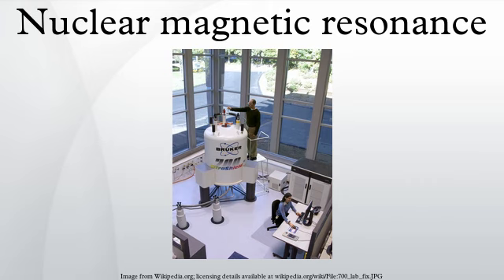Alternatively, 2H can be detected in media specially labeled with 2H. Deuterium resonance is commonly used in high-resolution NMR spectroscopy to monitor drifts in the magnetic field strength and to improve the homogeneity of the external magnetic field. 3He is very sensitive to NMR. There is a very low percentage in natural helium, and subsequently it has to be purified from 4He.